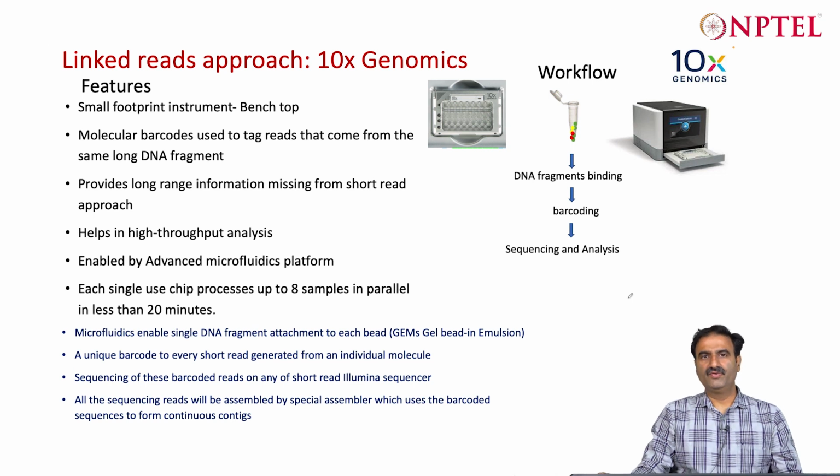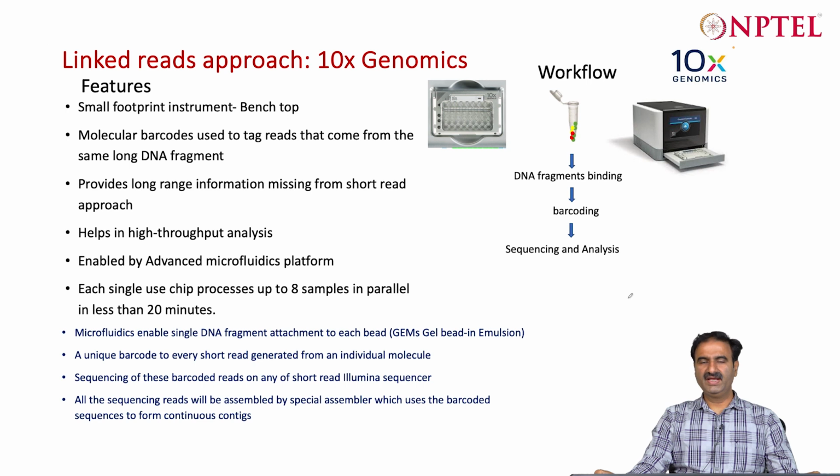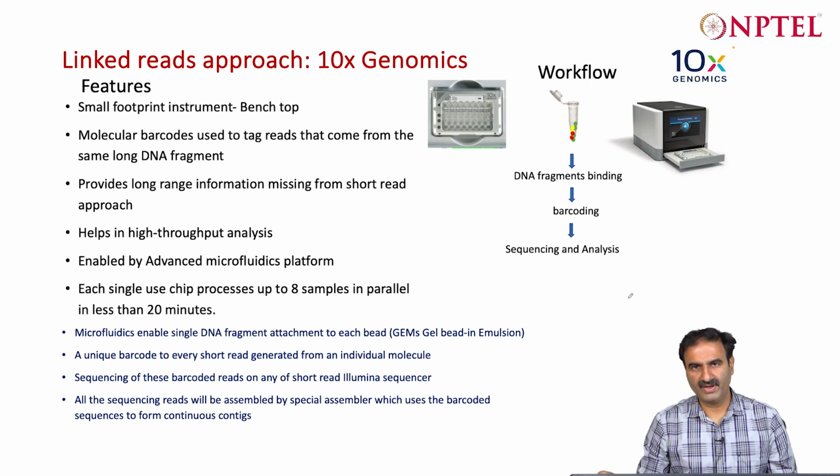First, let's briefly discuss what linked reads are. Linked reads are prepared by the Chromium instrument from 10x Genomics. 10x means large scale.